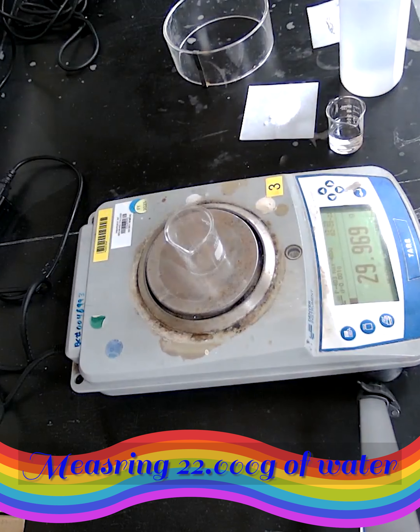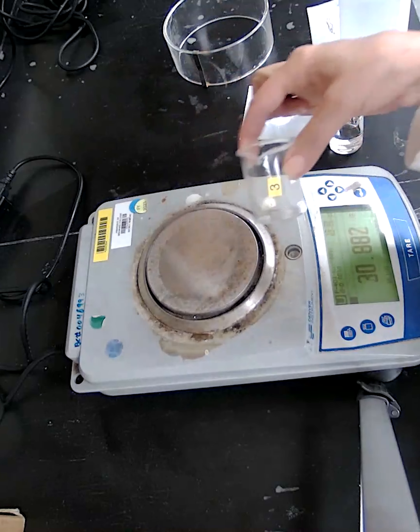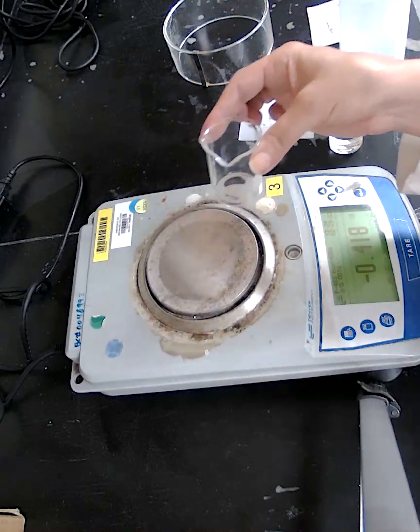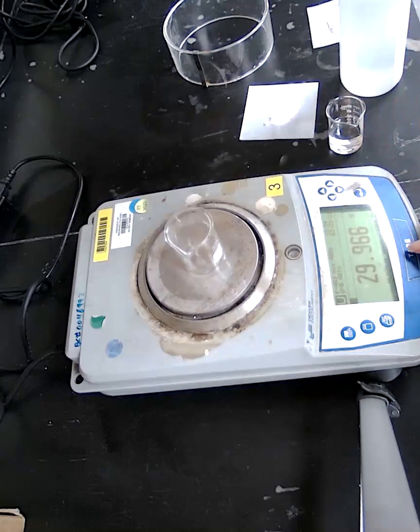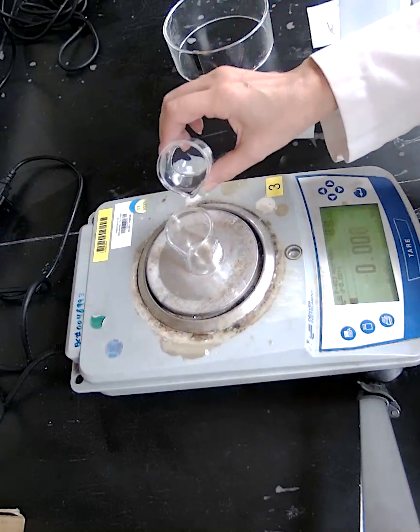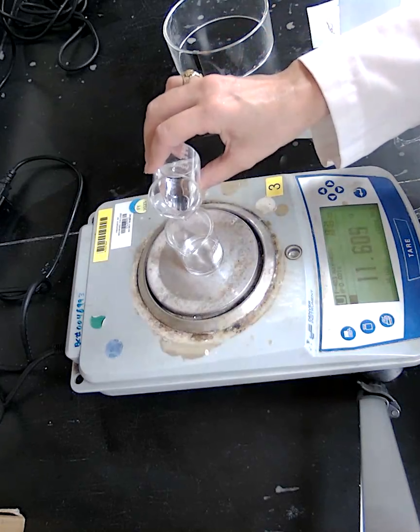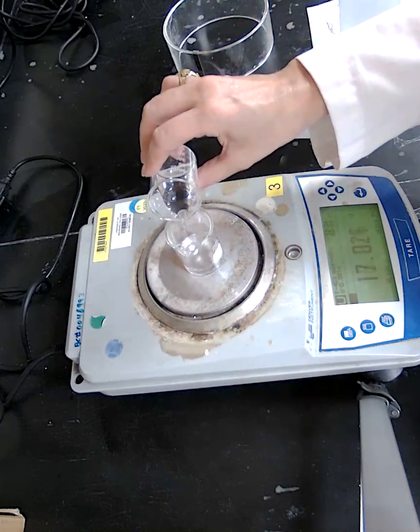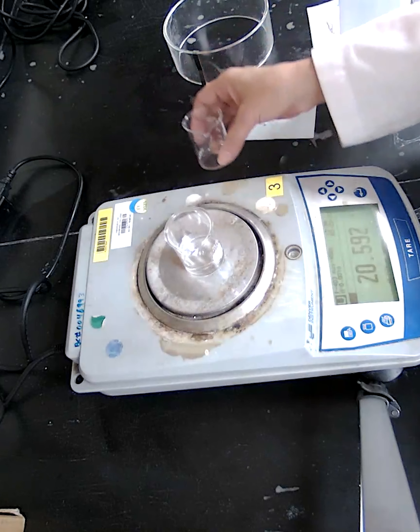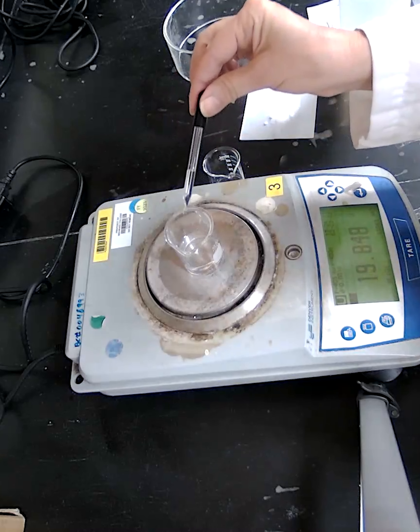Next, we want to measure 22 grams of water. For water, you need a beaker or graduated cylinder to hold it. Place the beaker on the scale and press the tare button to zero it. Add water slowly until it reaches 22 grams, using a dropper to fine-adjust. Remove water if there's too much, or add more if it's not enough.